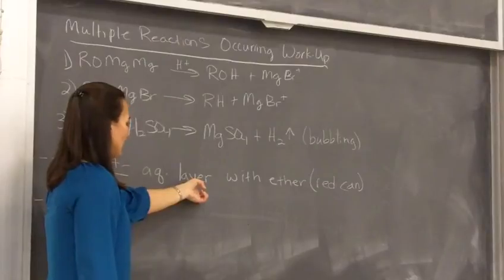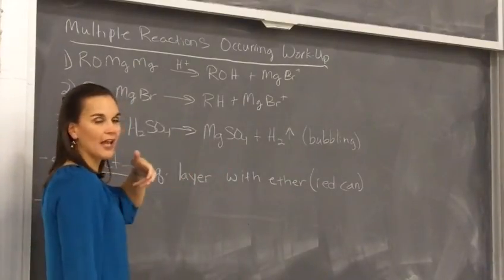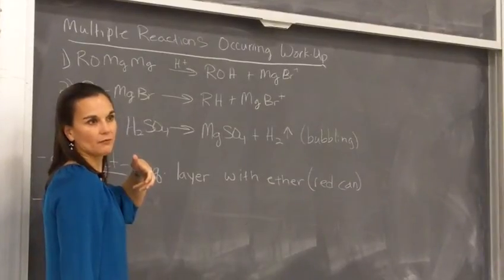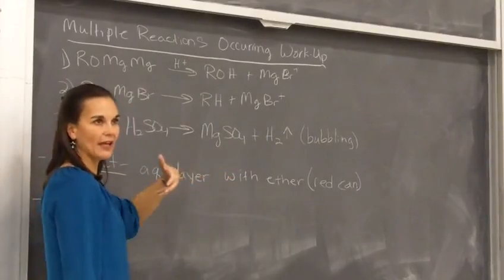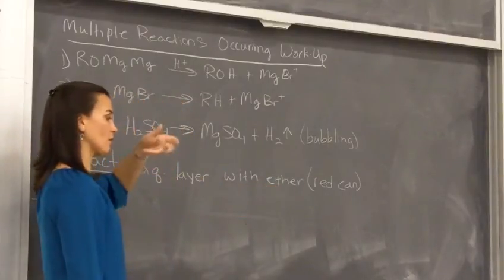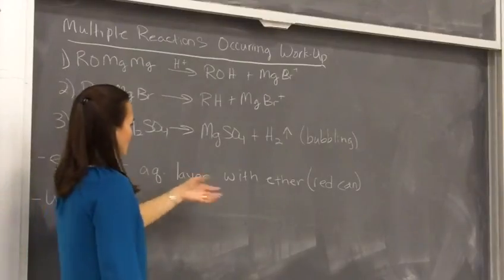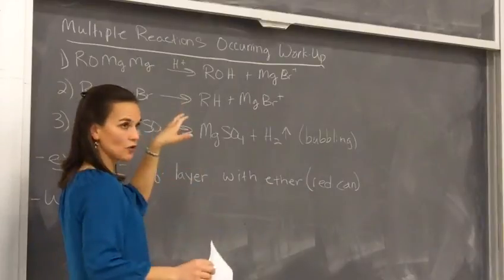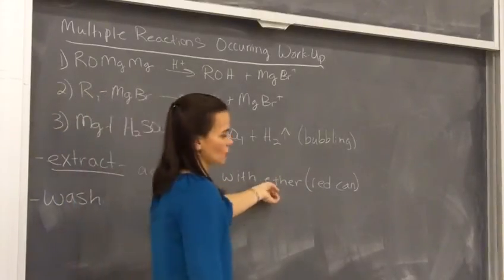We're going to add the ether to our aqueous layer, and it's going to extract, take out of the aqueous layer, any remnants of our product that's still left in that aqueous layer, okay? So extract means we want to take out of that layer, in this case with an organic solvent. They sometimes can go the other direction as well, okay? You're going to have two ether layers then, because you've separated your two layers. You have the aqueous layer, the ether layer, and then that aqueous layer we are extracting with ether.